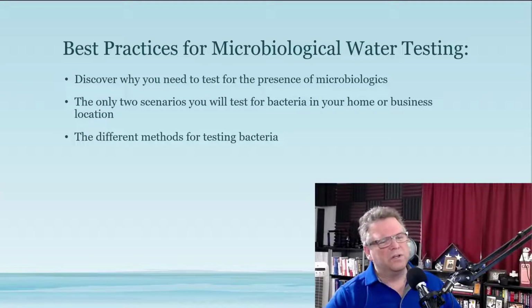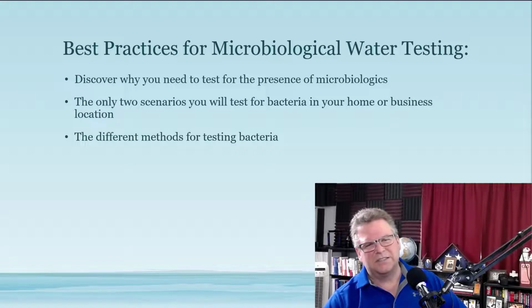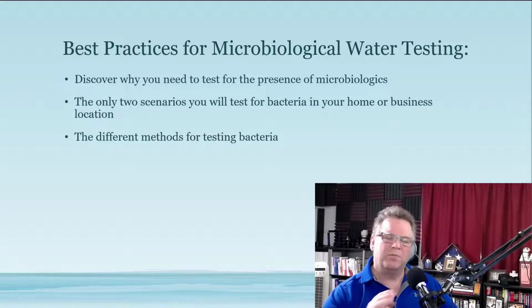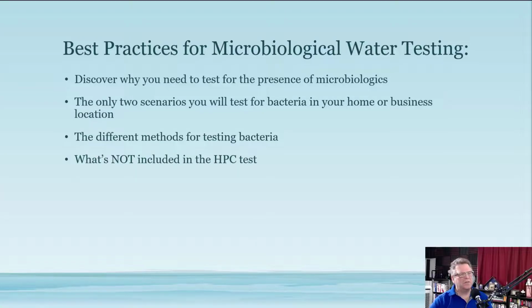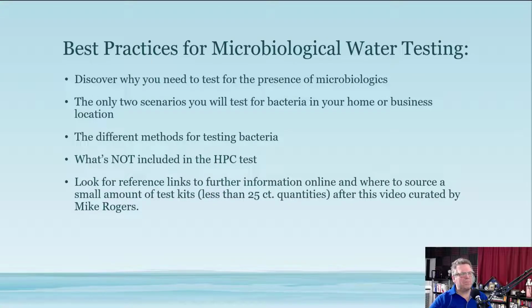You're going to discover the different methods of testing bacteria, and there's only three, but I want you to be prepared for them to find the best testing solution for your situation, whether it be in-home or if you decide on doing a mail-in for water testing to a state licensed water testing lab facility. I'm also going to be covering what's not included in an HPC test, and I'll explain what HPC means as we go.